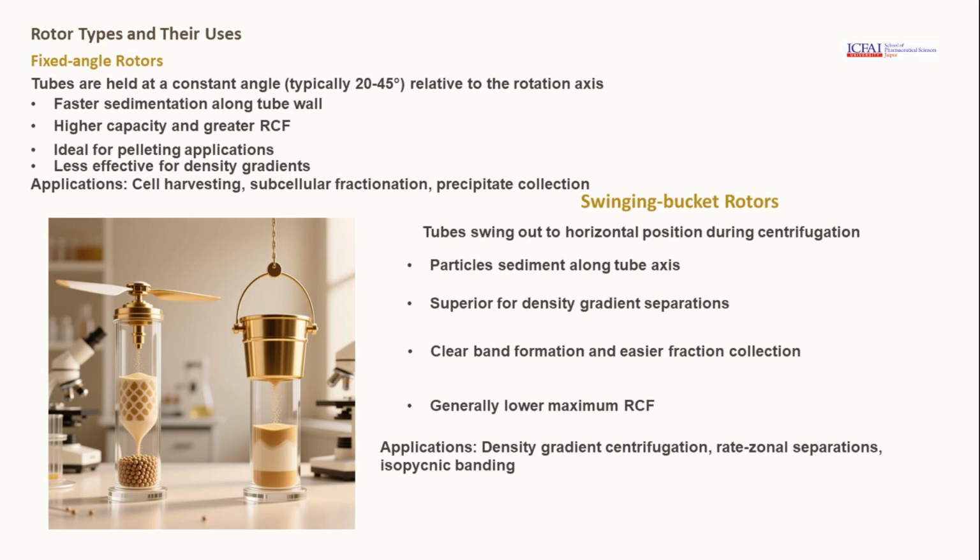Rotors are crucial components of centrifuges, with fixed angle and swinging bucket rotors serving different purposes. Fixed angle rotors are ideal for pelleting applications, while swinging bucket rotors excel in density gradient separations. Understanding their uses helps optimize centrifugation processes for specific research and industrial applications.